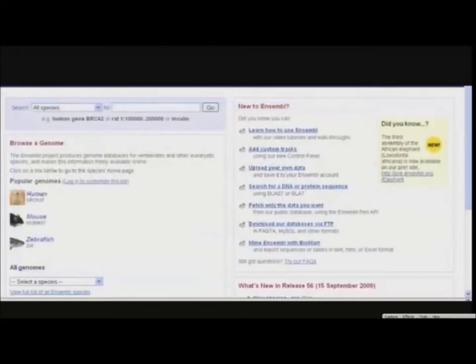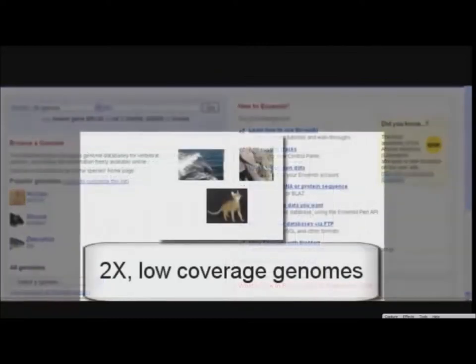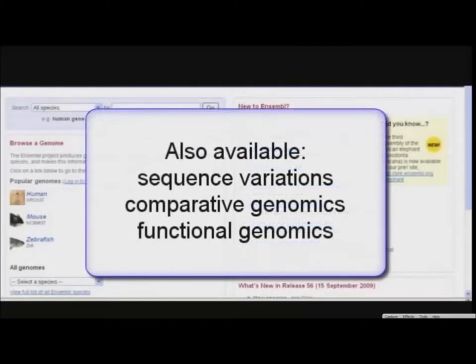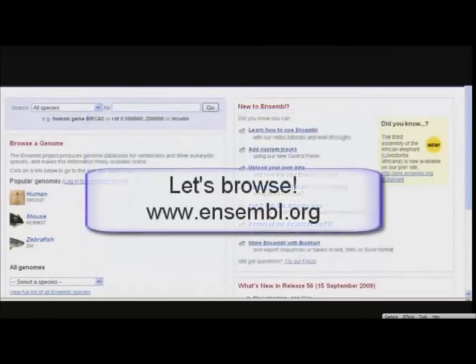For some species, such as human, Ensembl includes manually curated transcripts from the Vega-Havana project at the Wellcome Trust Sanger Institute. Ensembl provides gene sets for even newly sequenced, low-coverage genomes such as cat, elephant, and dolphin. Other annotation includes variation mapping, comparative genomic studies, and functional genomics. Let's see how the browser arranges this information.